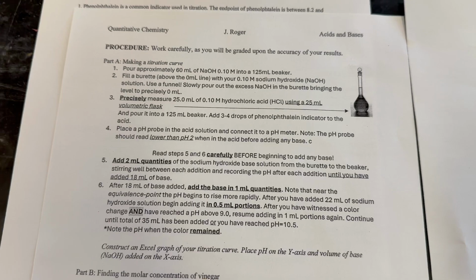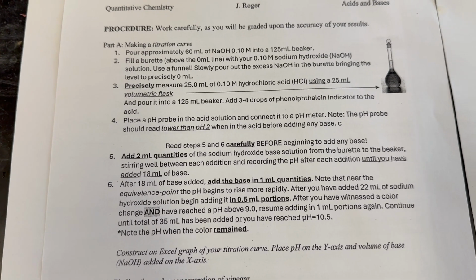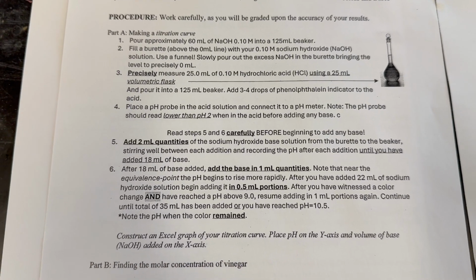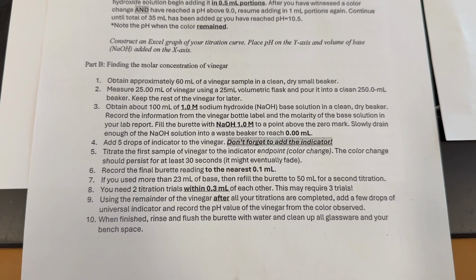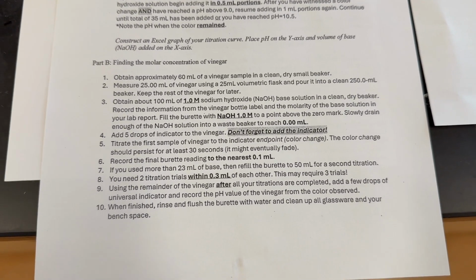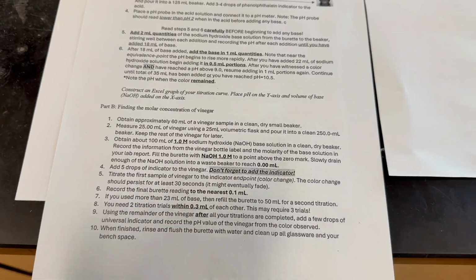So we're going to monitor the pH as we titrate a strong acid with a strong base, HCl and then NaOH. The classic. The second part is going to be aimed at finding the molar concentration of acetic acid in vinegar. And this one will be more of a traditional titration with a 1 molar NaOH. So we're going to begin.